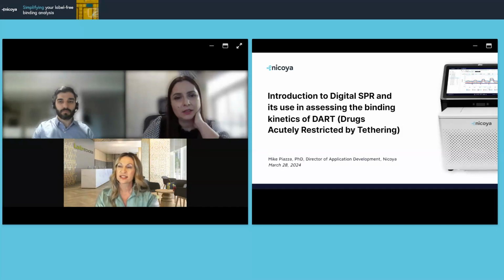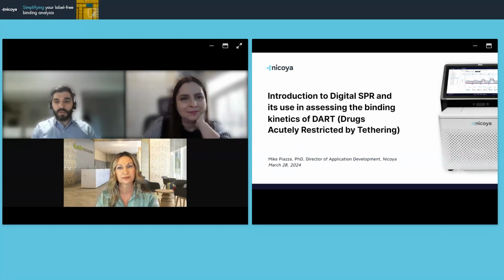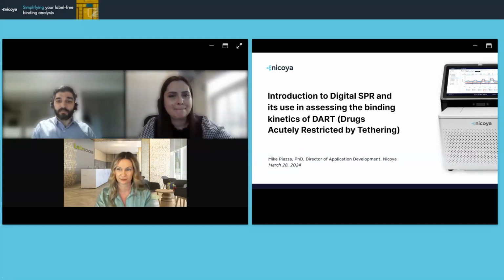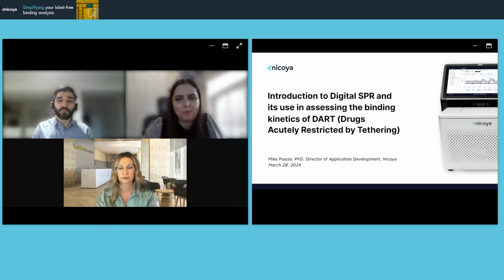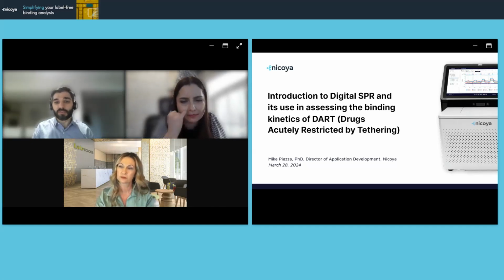Thank you. Does the electrode of the SPR sensor have to be made out of gold, or would a carbon electrode also work? Yeah, that's a good question. So the SPR sensors themselves are the fiber optics that are integrated into the cartridge. We use gold nanoparticles on there. That is one of the basic properties of the localized surface plasmon resonance that we employ. So for the Alto and OpenSPR specifically, they have to be the gold nanoparticles.